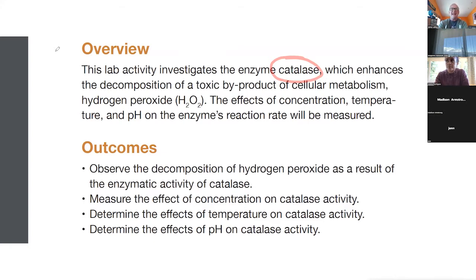Now, when it says it enhances the decomposition of hydrogen peroxide, what does that mean? It enhances it. Can anyone give me a brief rundown of what enhances means? Accelerates, yeah, big time. That's basically what enzymes do.